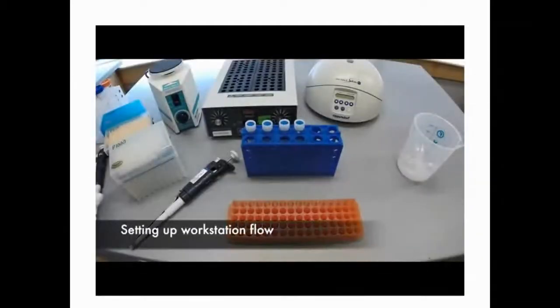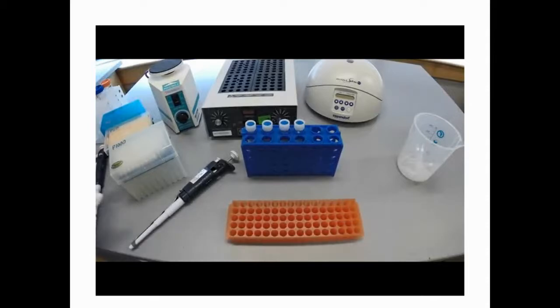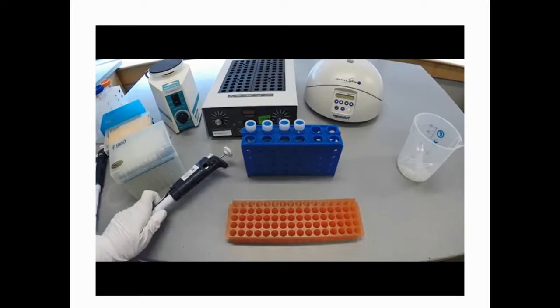Before beginning any protocol, you want to make sure that your workspace has a proper flow to avoid contamination of samples or reagents. This example is set up for a right-handed student. Tips and pipetters are on the left.